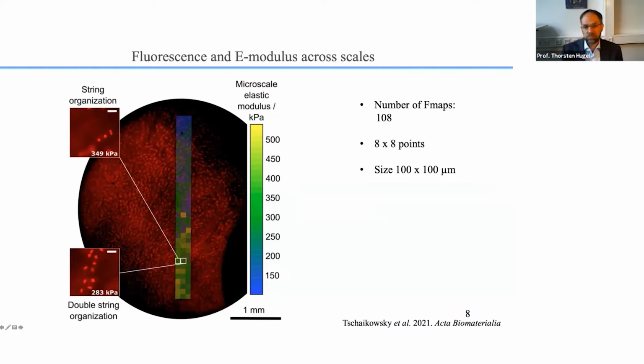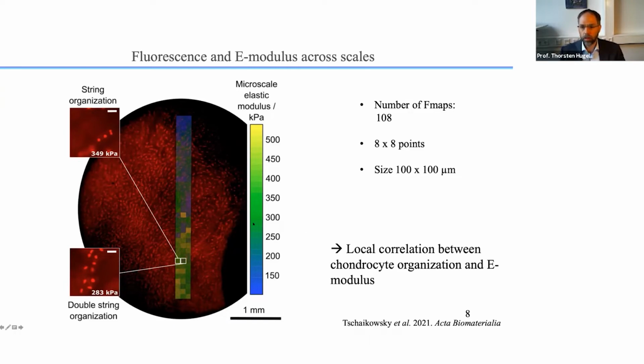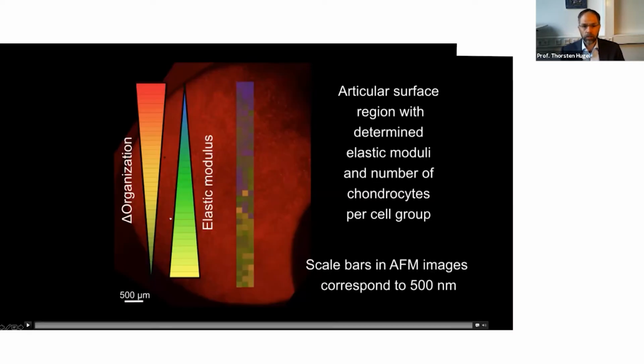And now we want to look at the even smaller scale, that is, the nanoscale. And this is what you can nowadays do. So here we use the QI mode. It's similar to FFM mode or pinpoint mode or peak force mode. So every company calls it a little differently. This is, I think, something like 3 million force traces that we will see the result of now, that Matthäus took. And this is a movie.